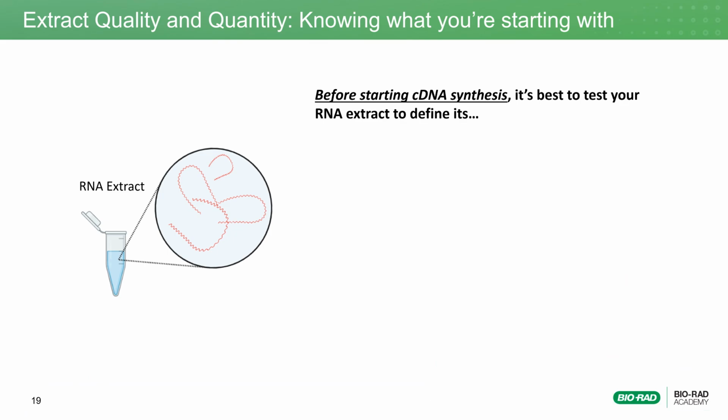So far, we've explored the importance of isolating a pure and intact collection of RNAs when utilizing RT-qPCR. In doing so, we've also reviewed the importance of pairing the correct RNA isolation kit with the particular tissue type and RNA biotype of interest. Additionally, we have covered some advisable best practices to perform when working with your RNA extract in the lab to ensure the quality of your RNA remains unhindered.